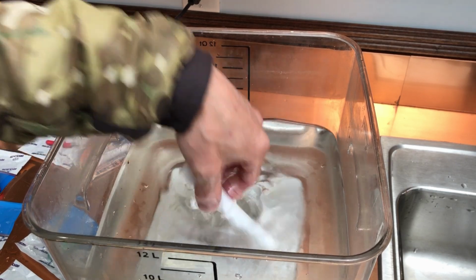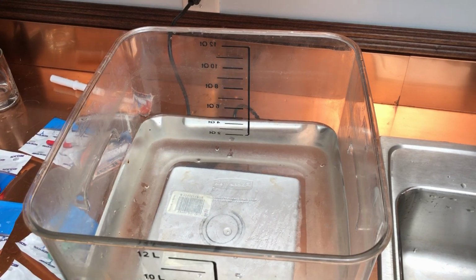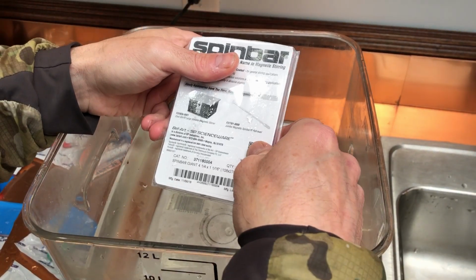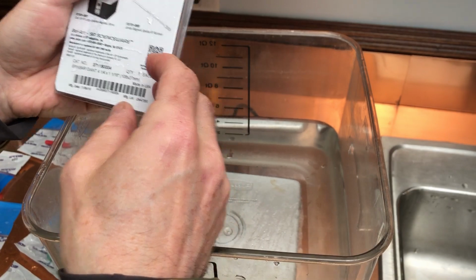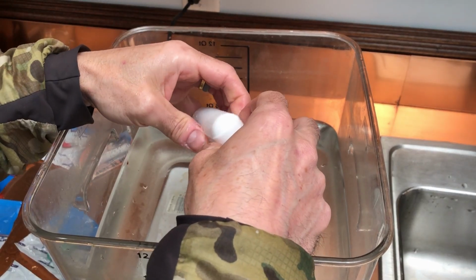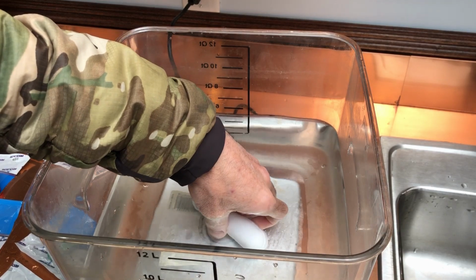Yep, I can't get it to work at all. Now what about this monster? This is a giant 108 by 27, which is 4 1/4 inches. Because the diameter is so large, it's gonna have more magnetic force, and I think it's gonna work.